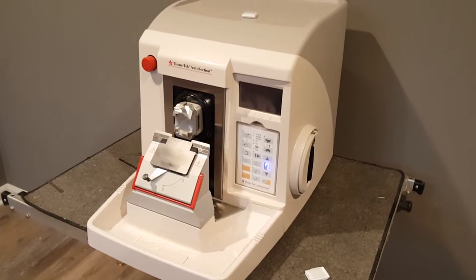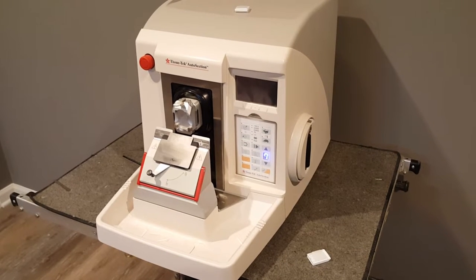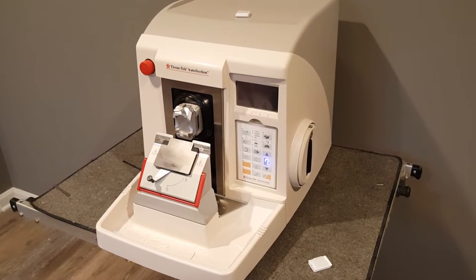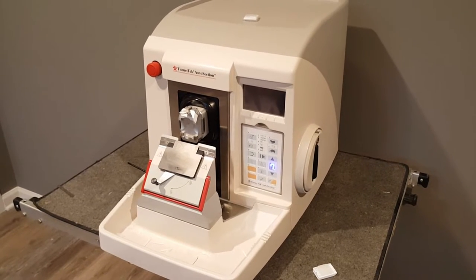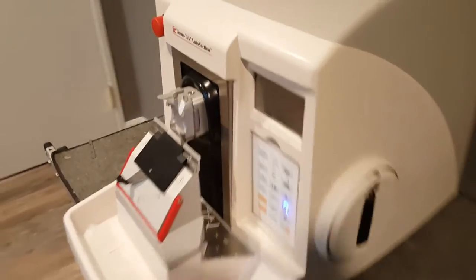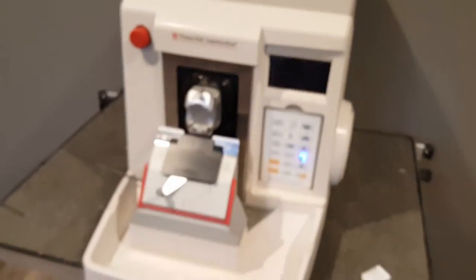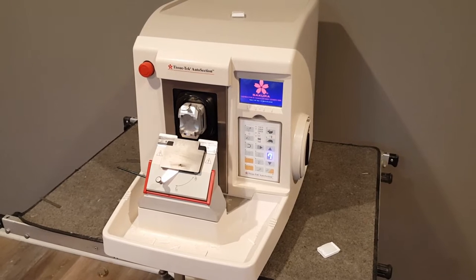I just got this microtome in — it's one I've never had in here, and I just wanted to do a quick video on it and show you what it can do. I don't know everything there is to know about it, but I do know a few things, so I'm going to turn this thing on. It's a pretty big unit compared to some of the other automatic microtomes out there.